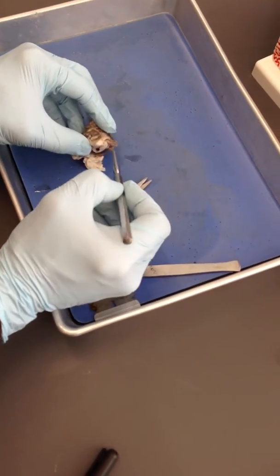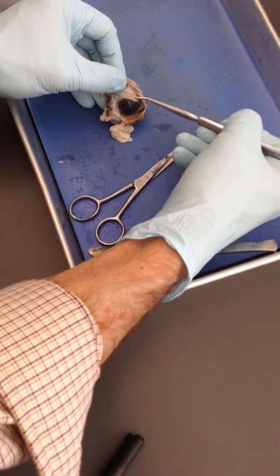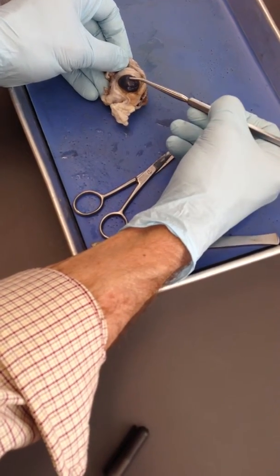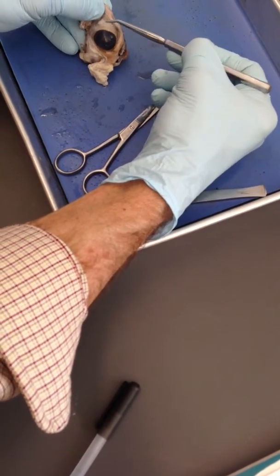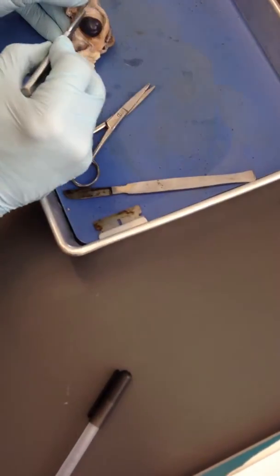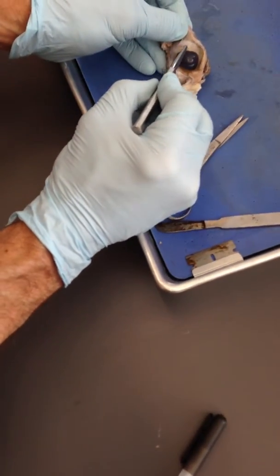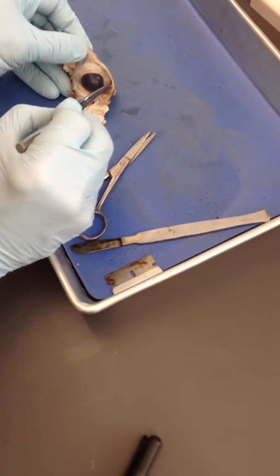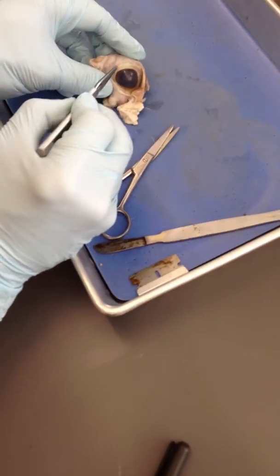If we look a little bit forward, I just want to point out conjunctiva. So the sclera right here continues over the front of the eye, but it's clear here. So the cornea is really a continuation of the sclera. It's just clear, okay? And we have some soft, vascularized tissue. Notice how soft this is, right immediately around the cornea. And this is conjunctiva. So this is vascularized, and when somebody gets conjunctivitis, this is what gets irritated. That runs to the underside of the eyelid here, so we have more of the conjunctiva there too. So this is all conjunctiva.